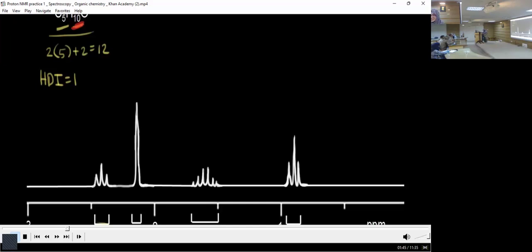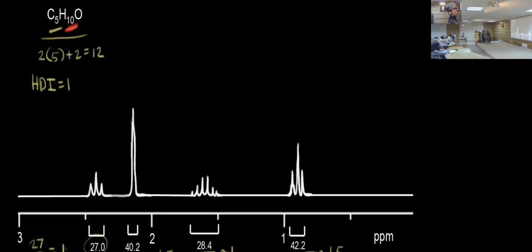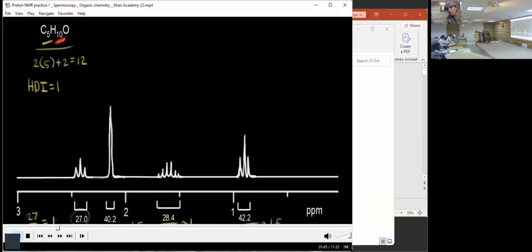Maybe I can call the CP. Yes, but the same. Control enter. Okay. I did.